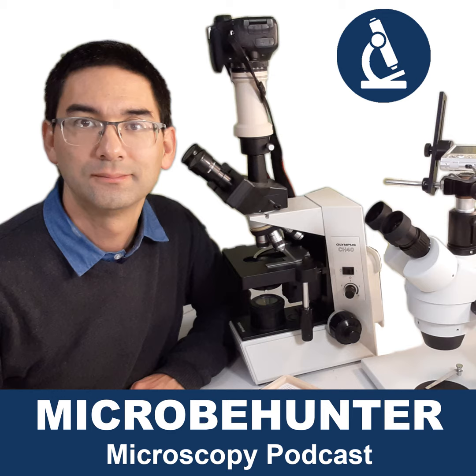But then again, even if you have more or less centered the slide, it might not be centered enough, because some specimens are relatively small, and you might have the cover glass of your slide under the objective, but maybe not the specimen, which is still smaller. So in order to center the slide properly, you should do that using the low power 4 times objective that I just mentioned before. So if you do not see anything, check whether the slide is centered.